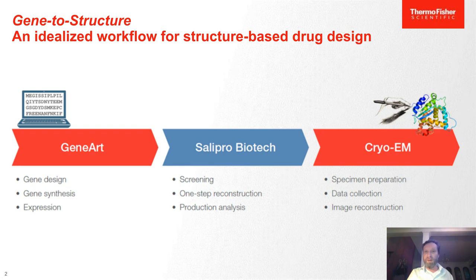Finally, it ends up with Thermo Fisher again, which takes the specimen proteins, prepares them for cryo-EM, freezes them, does the data collection and the image reconstruction to end up with the structure.